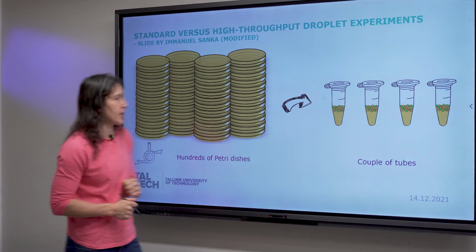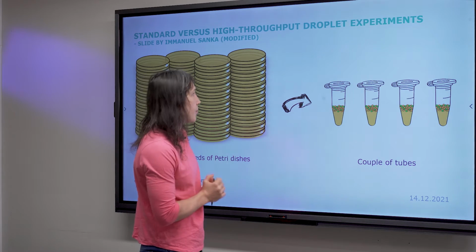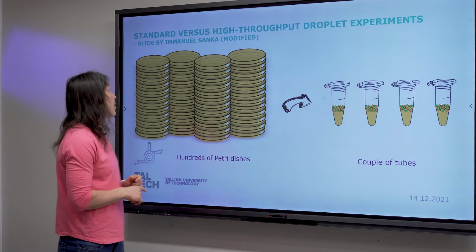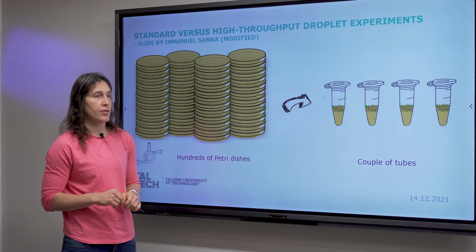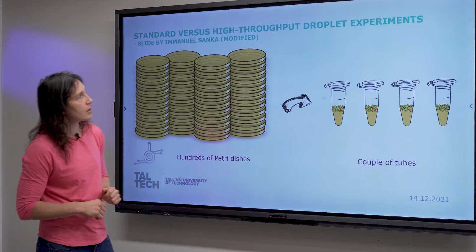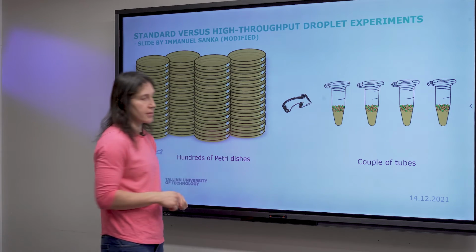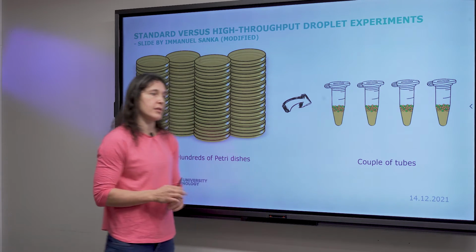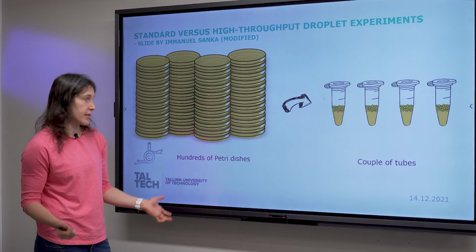All right, but let's dive in a little bit more about our standard versus high throughput investigation. High throughput means just many in parallel, which is very useful with droplet microfluidics.